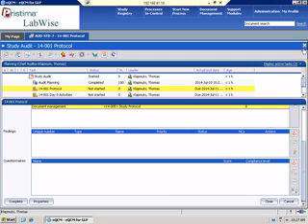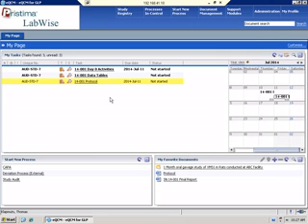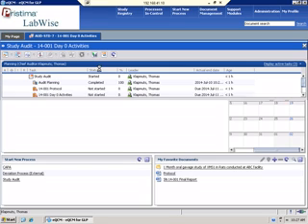So if I just close out of this, I can click close. It stays on my desktop until it's finished. So here, I have to wait for my protocol to be updated. What I can do is we'll go into the day 0 activities.